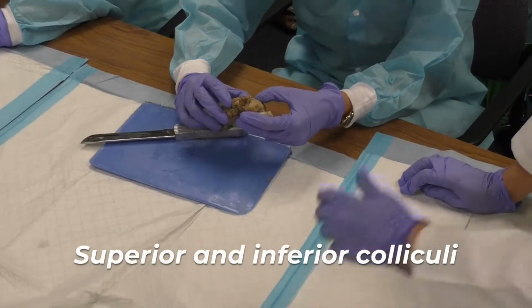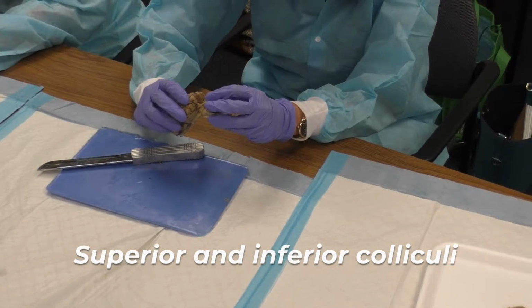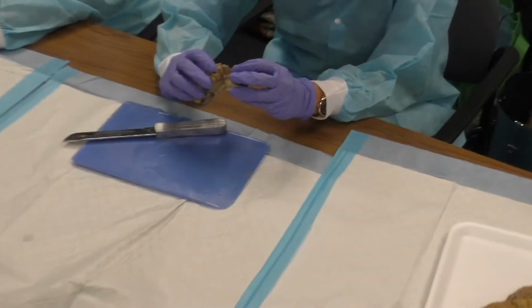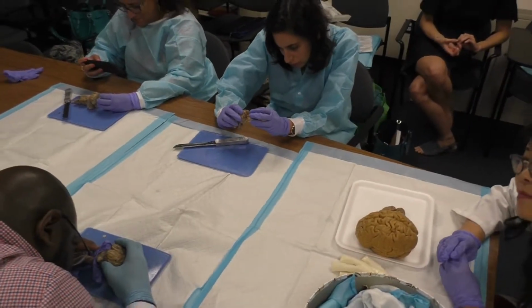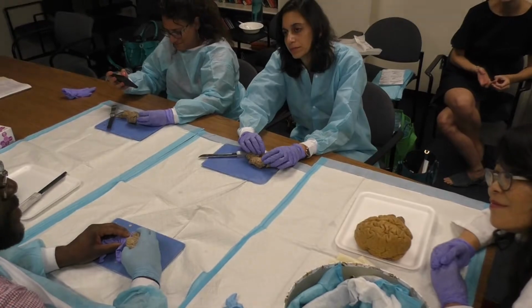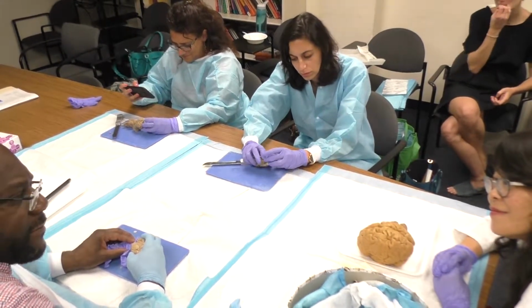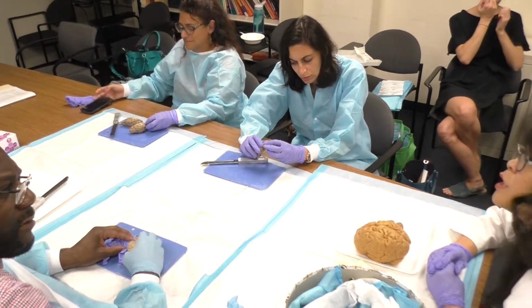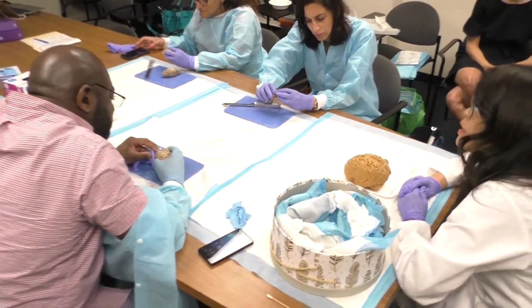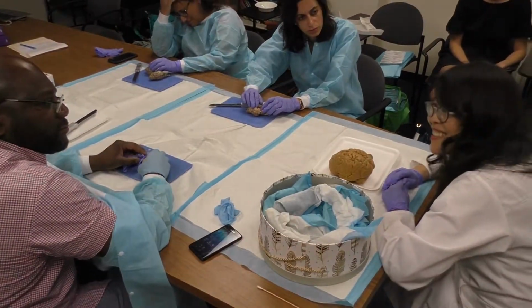And so what are the functions of those structures, inferior versus superior colliculus? I think they're involved in automatic responses to sudden noise and sudden visual stimuli, like flashing lights. It has something to do with vision, definitely. The superior colliculus is important for visual processing.